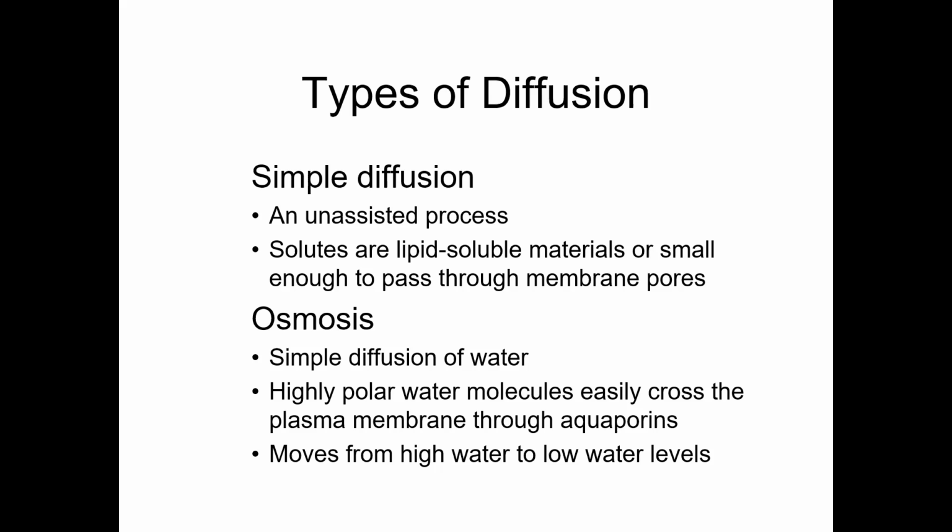Well, I've got an example set up here, a little experiment running. I'll show you here as we go through the next hour or so. I've made up a 10% salt solution, 10% sodium chloride in one beaker, and the other beaker is filled with distilled water.